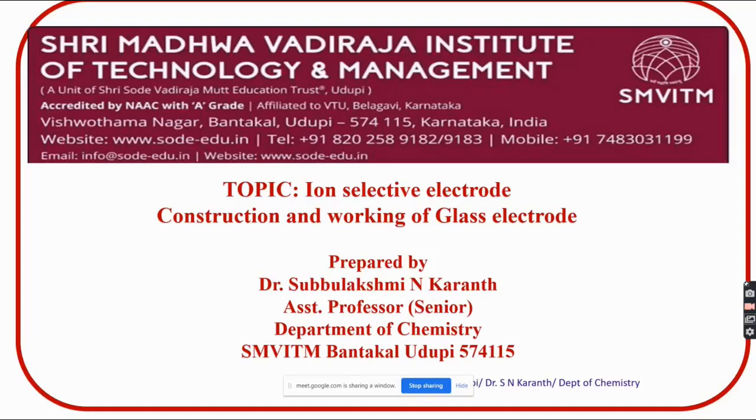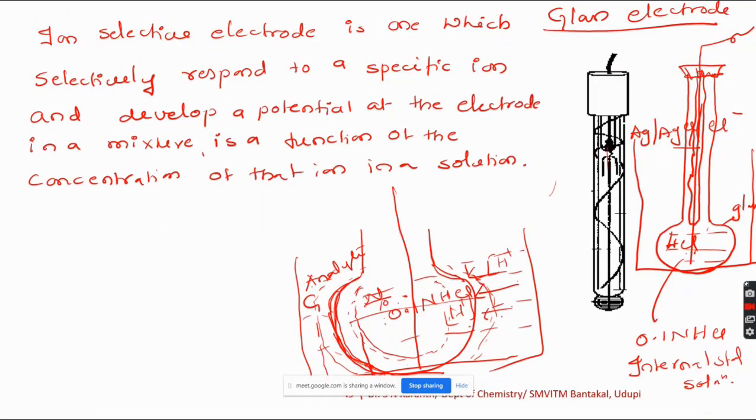In my last class, I talked about the ion selective electrode, its construction, and the working of the glass electrode. An ion selective electrode is one which selectively responds to a specific ion and develops a potential at the electrode that is a function of the concentration of that ion in a solution. In a solution there may be plenty of ions with different concentrations. A membrane is present in the ion selective electrode which responds to a particular ion and develops a potential at the interface.